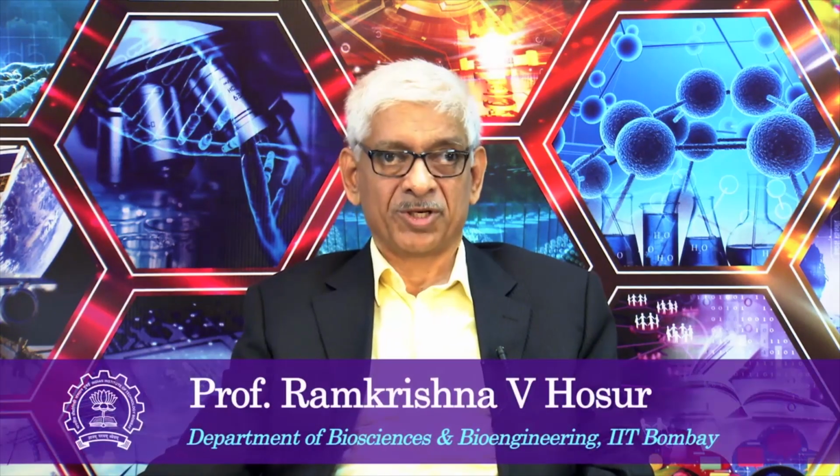This is used as an entity which is inserted at various places to obtain high resolution along the indirect dimension, and this becomes important even though I have limited T1 max, because I have removed the coupling information here. This becomes quite beneficial and improves the resolution in the spectra and measures the chemical shift positions precisely, and the coupling constants you can measure along the F2 dimension.